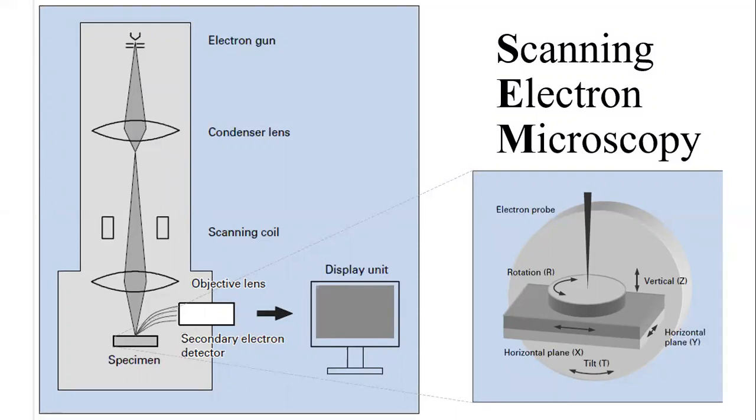The electron gun produces an electron beam. So here is the electron gun, which is only a filament of mostly tungsten. So the electron gun produces an electron beam. This is your electron beam. You have a beam, which is made of electrons. Placing a lens below the electron gun enables you to adjust the diameter of the electron beam. The objective lens are used for focusing.